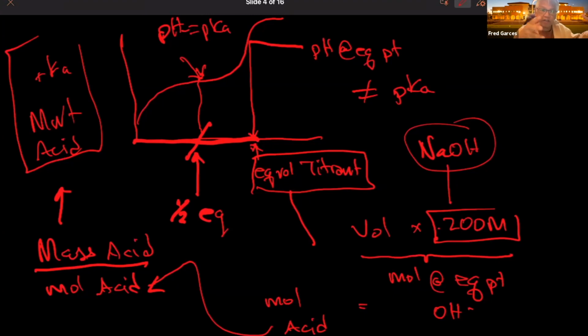The greater the standard deviation, the less precise you are. Not very good in terms of the data. But if your standard deviation is small, it means that each of the measurements is very close to the average, which generally means that you have good precision. So we do a minimum of 3 trials, and in this particular lab, that's not an exception. We do 3 trials, and then you can do an average, and then you can take a standard deviation.